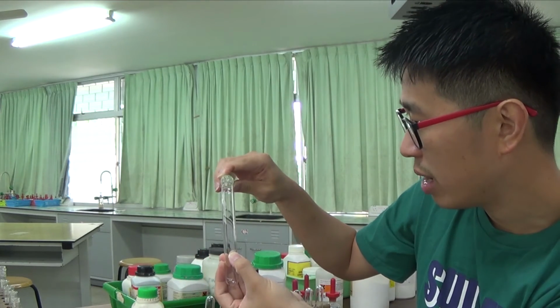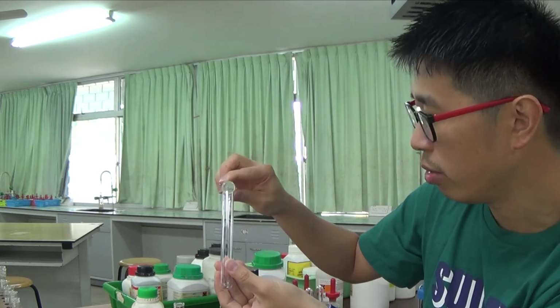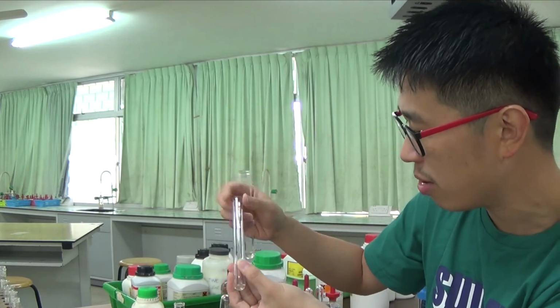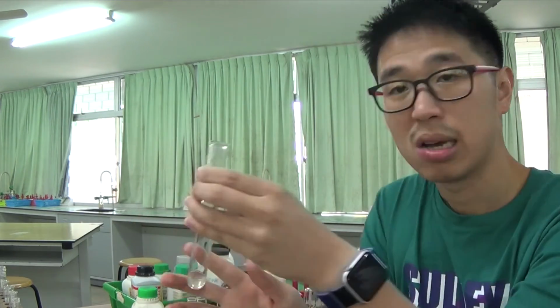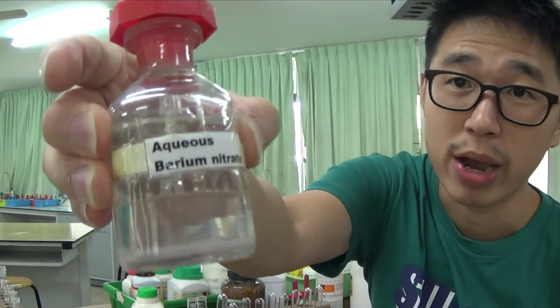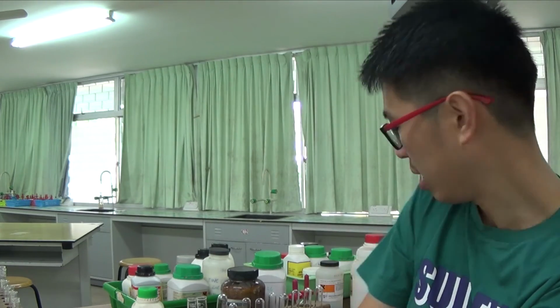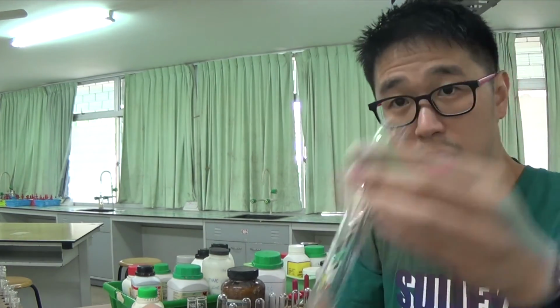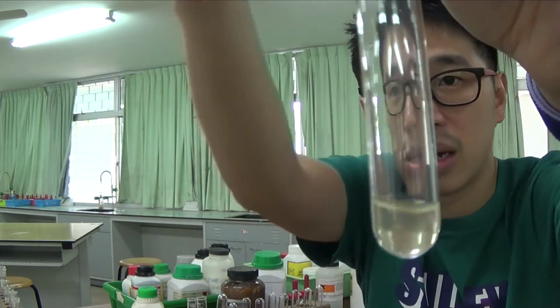I will test for the anion very quickly because we know that it is a sulfate, so I won't go and look for other anions now because my focus will be on the sulfate, where I use barium nitrate or barium chloride. Okay, so they will do the same thing. This is almost a clear solution, so it's a bit colored. Okay, what happened?